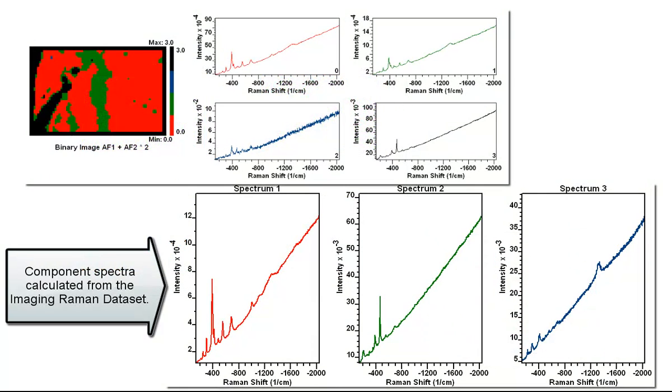Once you've got this chemical imaging, you can then use false color maps, extract spectra, and do the vector calculations that we've done with the XPS datasets before.